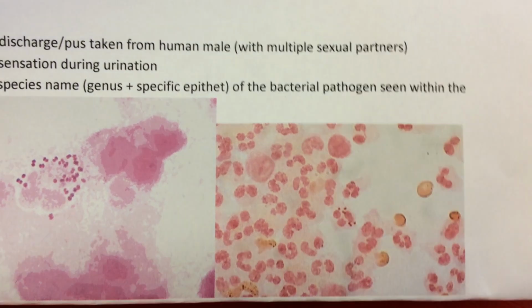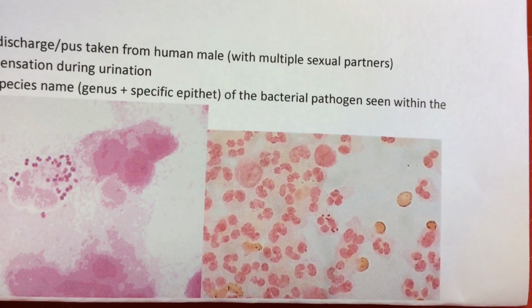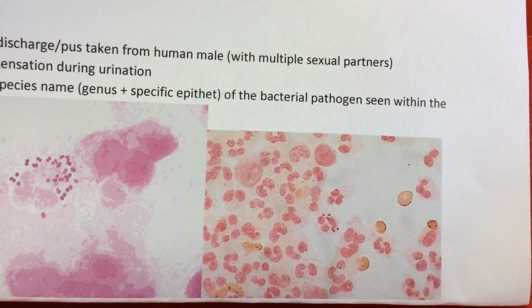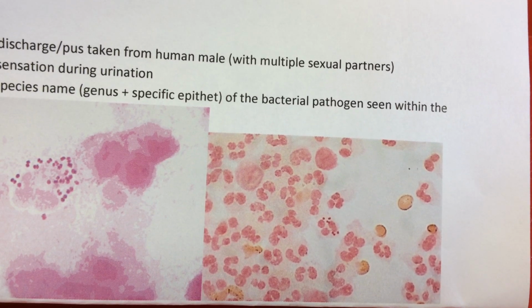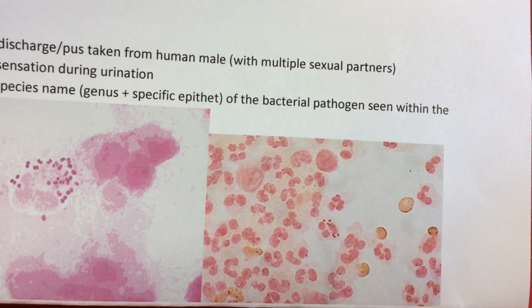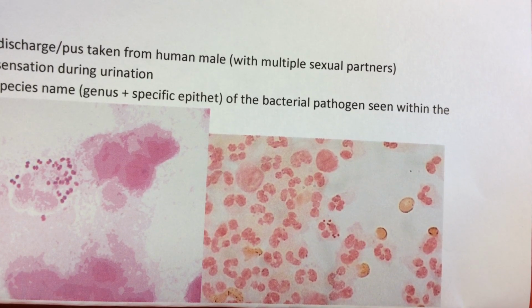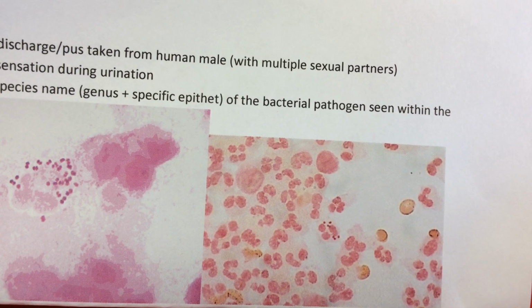The final specimen we'll be looking at in our Chapter 5 microscopy lab will be stained urethral smears from a human suffering with a bacterial infection, Neisseria gonorrhoeae. So Neisseria gonorrhoeae, which causes the infectious disease gonorrhea, can be transferred sexually. It can grow on the mucous membranes of the genital mucosa. And Neisseria gonorrhoeae will trigger a really strong inflammatory response. So we'll have attraction of lots and lots of white blood cells.